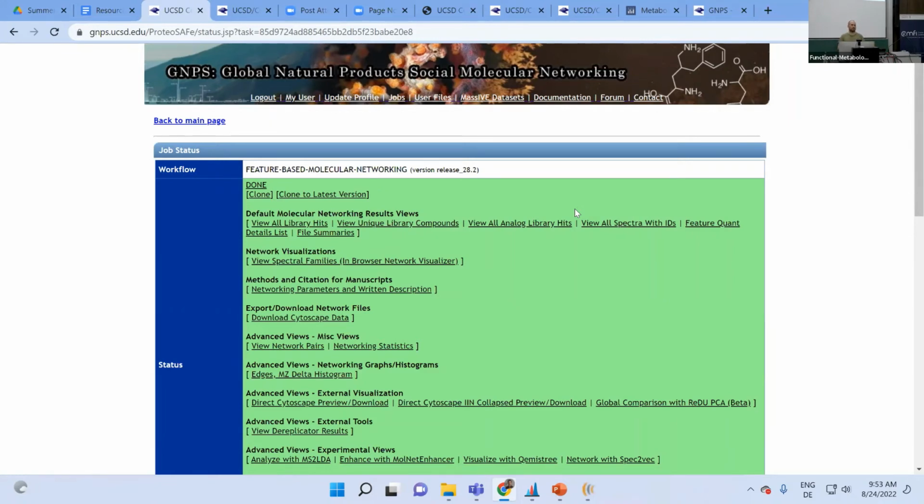So there's not any column where you apply a threshold and say, okay, this is optimized. I mean, we already apply some threshold, right? The standard is cosine similarity 0.7. Then 6 matched signals, which is already a lot for very small molecules. We typically lower it to maybe 4 for very small ones, but you should also be careful, right? You can also lower the cosine similarity, because you could get true matches with 0.6 or something, but you also get way more false positives.